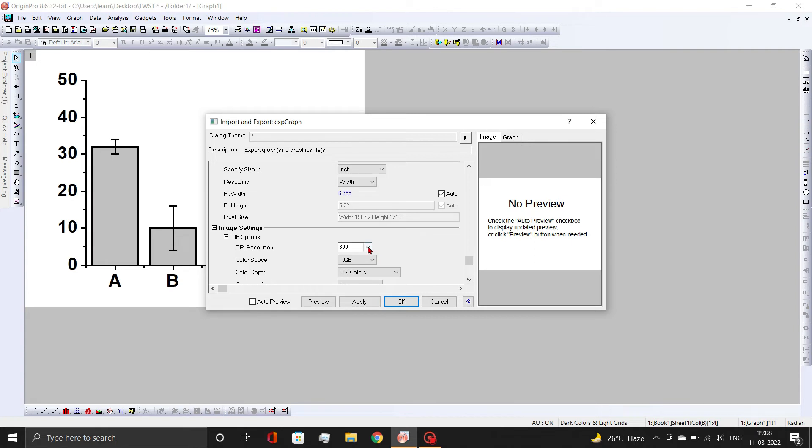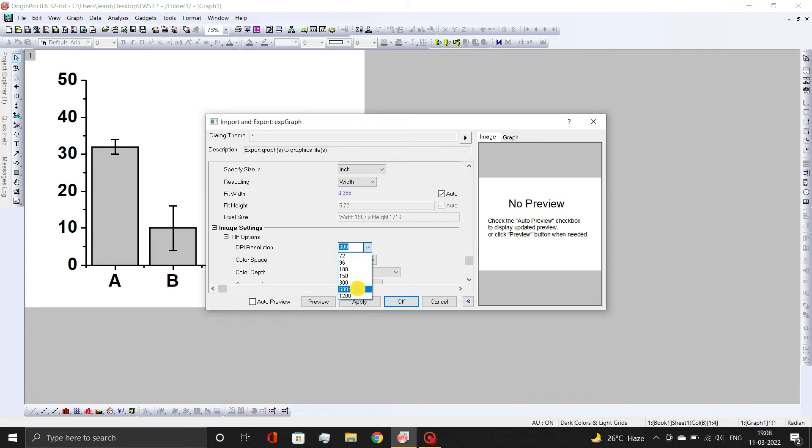Now, in the image settings, set the desired image resolution. Then, click OK button.